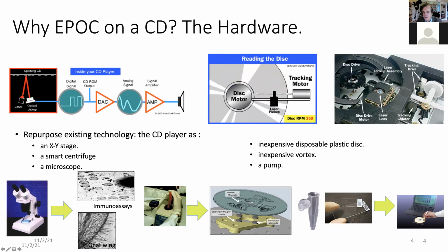I'll explain that, I'll come back to that later. That metal disc can destroy the cell walls and release the DNA, the proteins that are inside the cells. And that's what you do in a vortexer. But don't worry if you don't understand that one yet. I'll come back to it later.